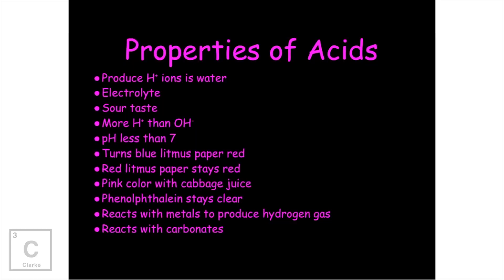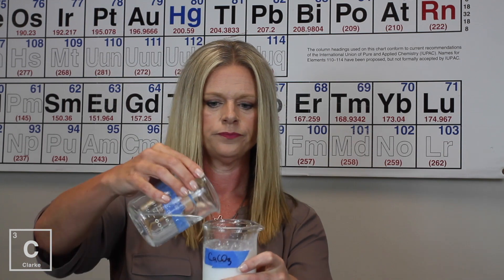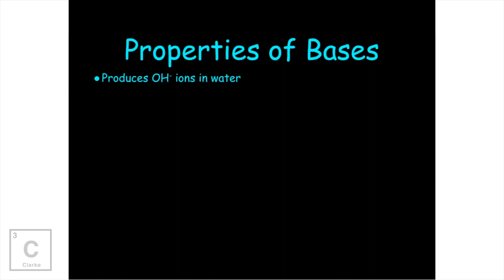Acids also react to carbonates to give off carbon dioxide. So I have some calcium carbonate. Calcium carbonate, that really is just crushed up chalk, but I made a solution out of it. Let's prove that acids react with carbonates. I didn't think it was going to have that big of a reaction. Oops. Let me clean that up. Okay, so that was properties of acids.